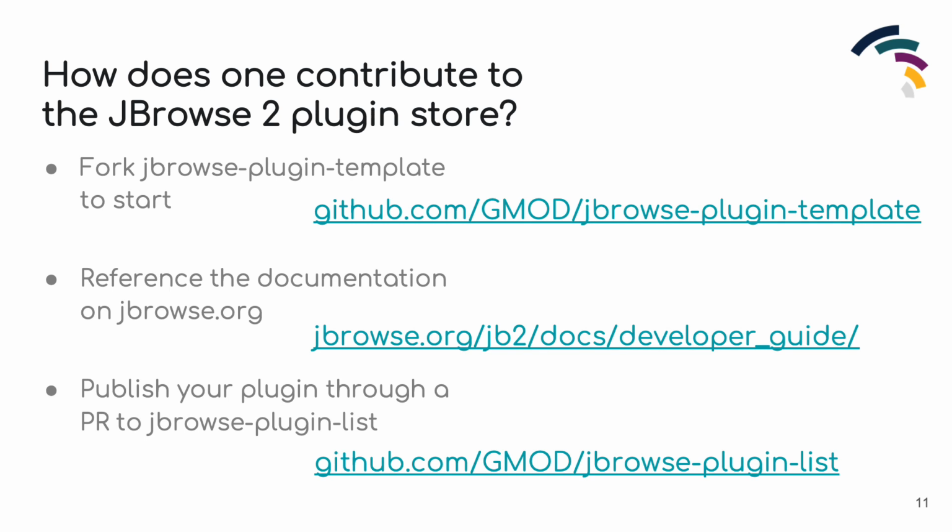You can even embed external JavaScript components into a JBrowse view, or extend upon an existing JBrowse view by creating a new renderer using extension points or the configure method of the plugin class. You can incorporate your favorite JavaScript libraries directly into JBrowse. Plugins can be used both on web and desktop JBrowse instances without any additional intervention by the developer.